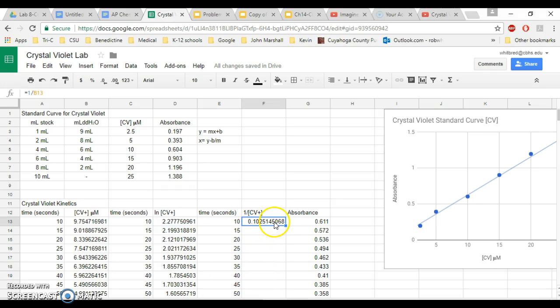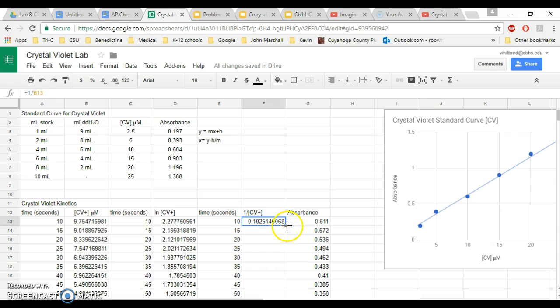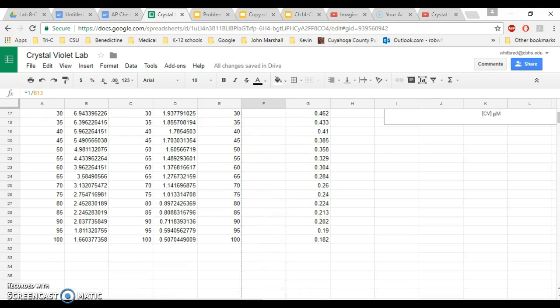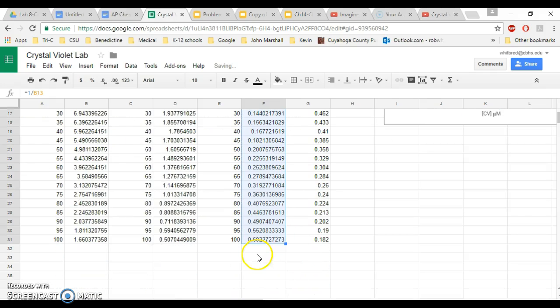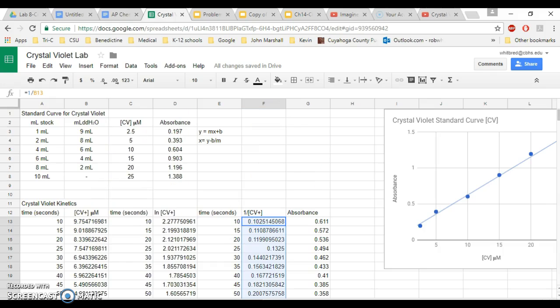Finally, you're going to do a third formula, and this formula is literally going to be 1 over B13. And again, I'm going to grab this and I'm going to drag all the way down. This way, if you set up your chart like this, you actually have all the data that you need to plot every graph in order to determine the rate order for your kinetics reaction.